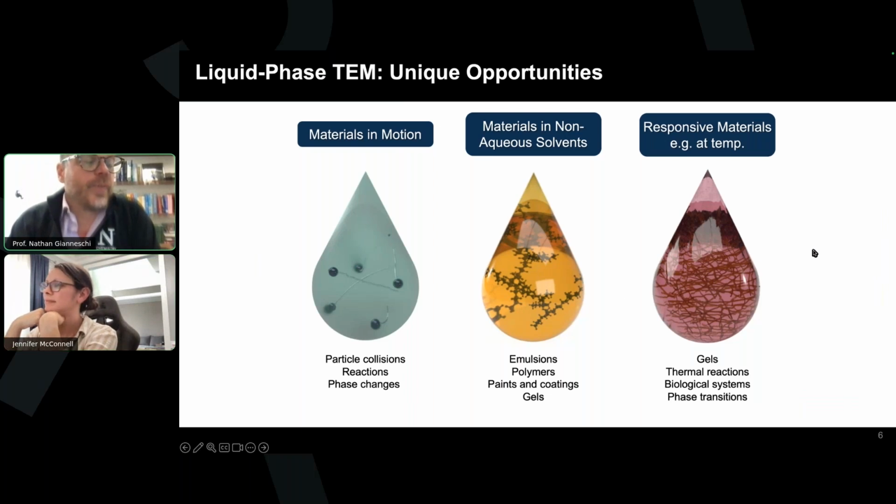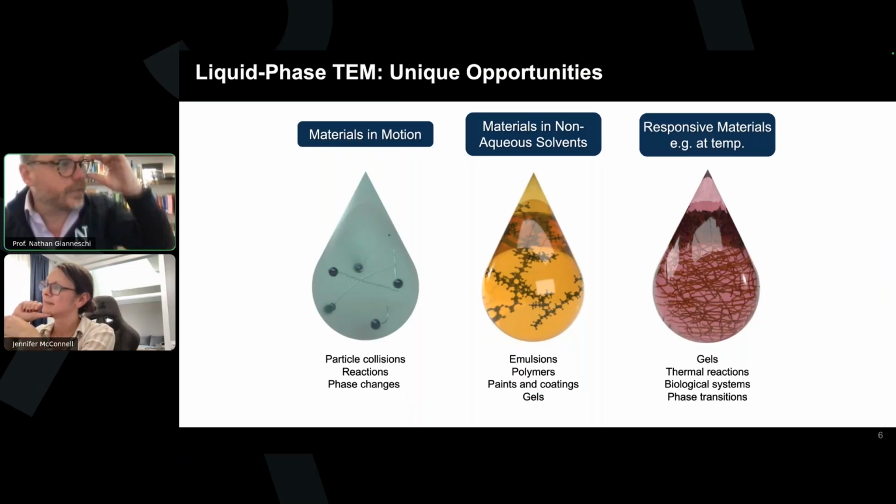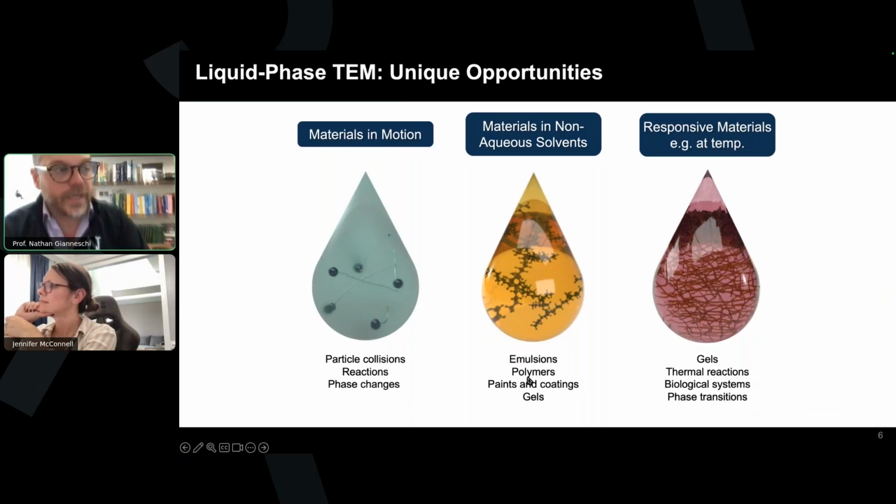and this goes back to, so Joe Patterson was a postdoc with me, now he's at UC Irvine, many of you know. We thought in the early days about our time with this anyway, in sort of 2014, 15, 16 period, about exactly that question. This is a list of things we thought of, right? Things that, as I said, unique opportunities, but maybe where the liquid cell can capture things that are quite difficult by cryo-TEM in particular. And of course, dynamics, although there are ways around that, obviously, by doing sort of freeze frame imaging, if you like, sort of mixed systems. So that's why we've picked on emulsions.